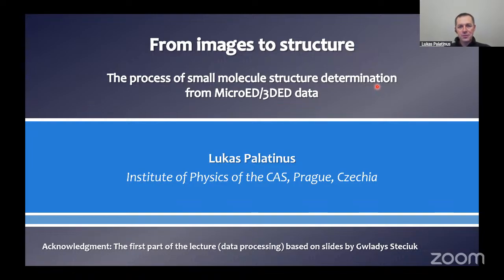Well, I first encountered the field when it was called ADT, and I went through all the changes of name and proposals of various names. For me, 3D ED is the preferred abbreviation, but MicroED is just the same thing, and I hope that we can get over the little fight that we had on the topic.